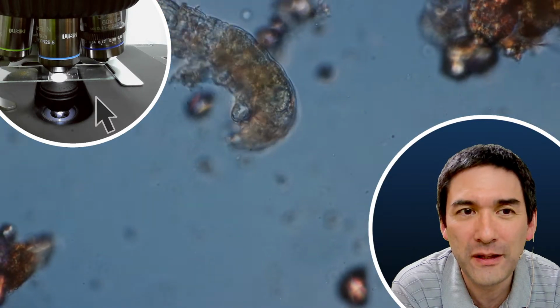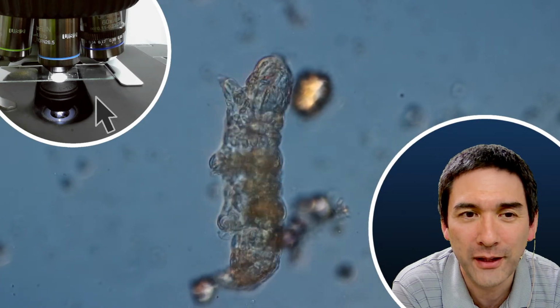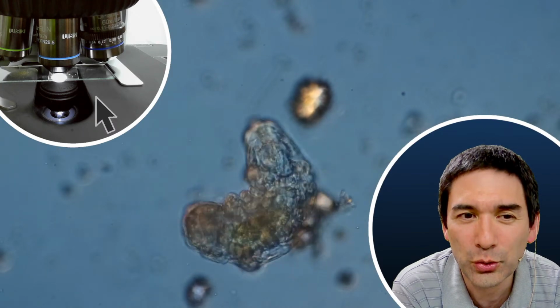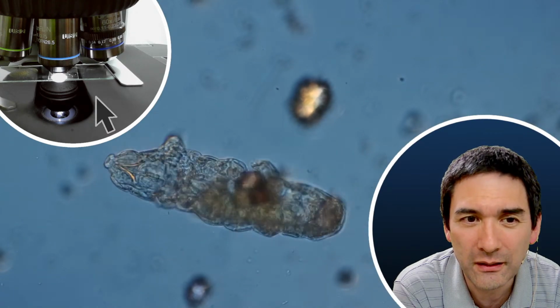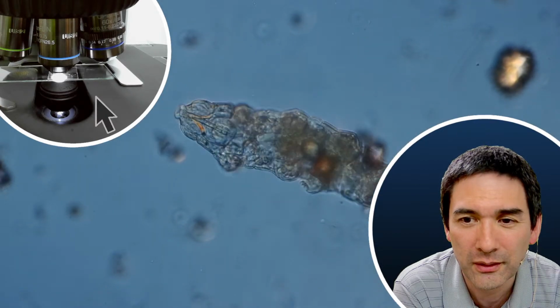Is it male or female? I wonder if they're hermaphrodites or not. Could it be that they're both? It's not unusual for some of these animals to be both. That could be one thing, but it could also be that they actually have two genders.